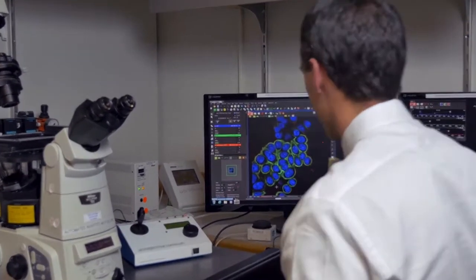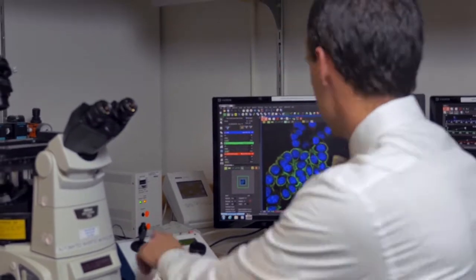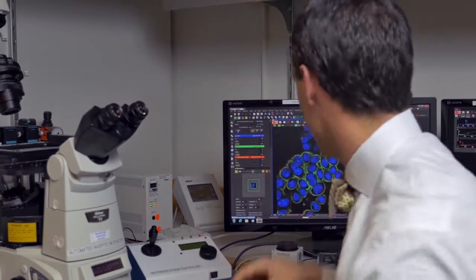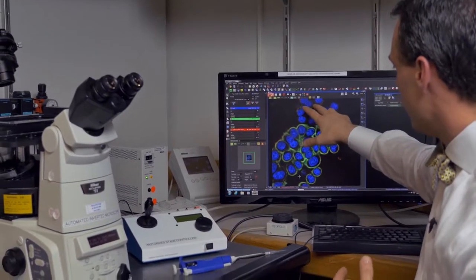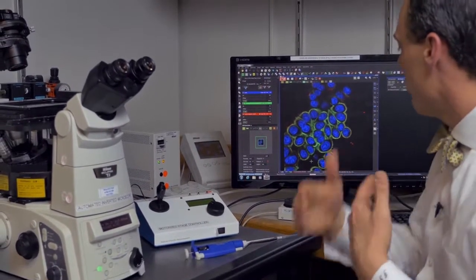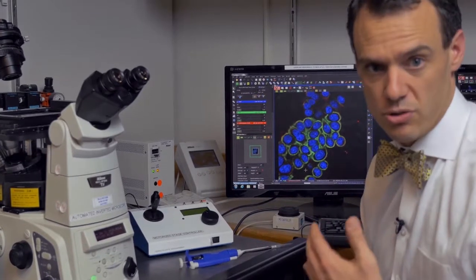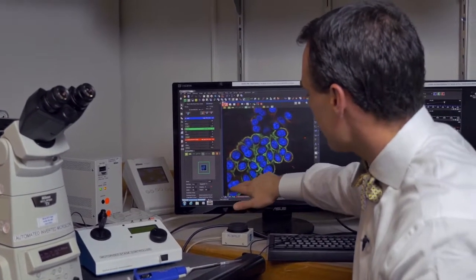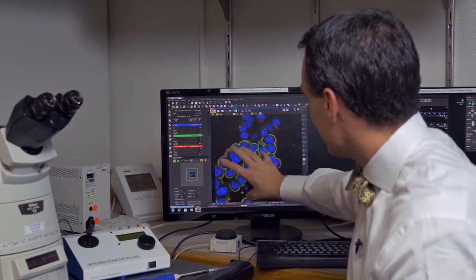We are starting to see some interactions going on here. The cells are gradually starting to take in this basil essential oil. We're starting to see it first happening here along the cell membrane. Now the refresh rate of this is about every 30 seconds, so we're kind of getting stop action as this laser is scanning these cells. We now see it heavily being incorporated throughout the cytoplasm of these cells as it starts to go into this body.